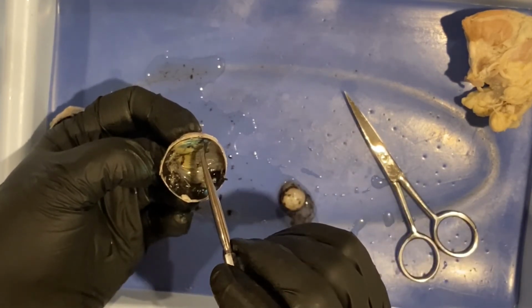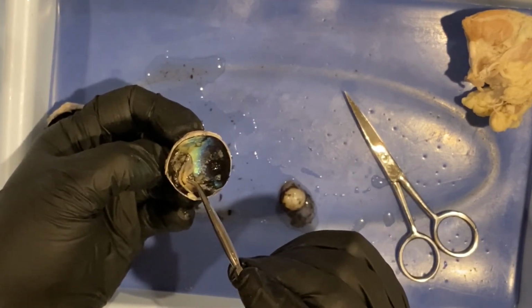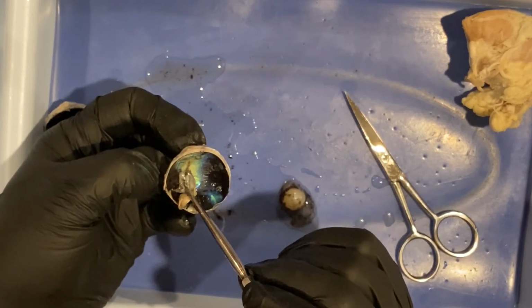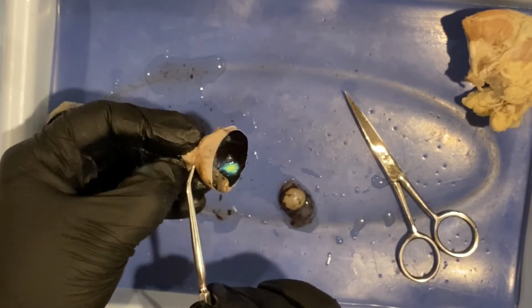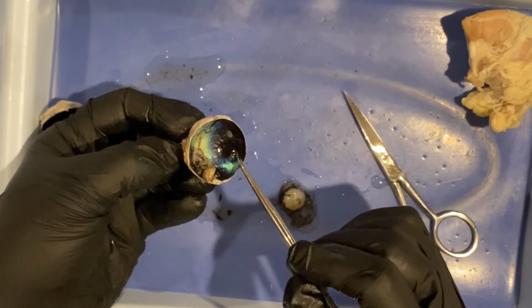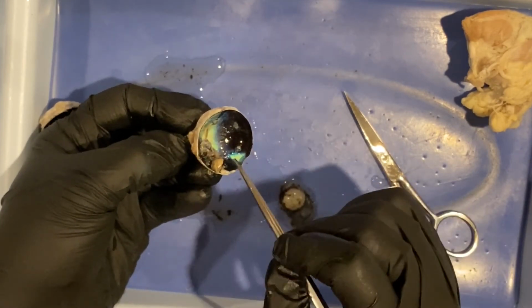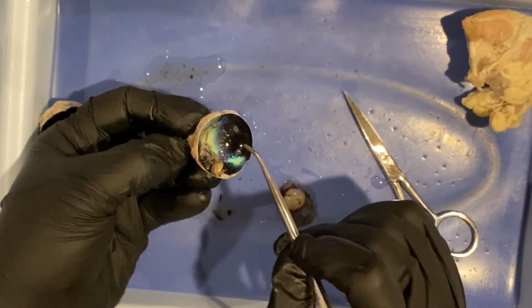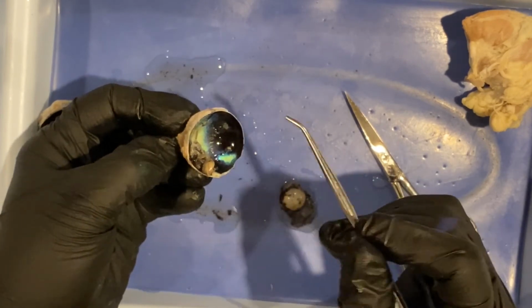Now, if I start to use my probe to pull that retina off, you can see the exposed black material behind it. And actually where the retina is still connected as I'm doing this is telling me that that is where the optic nerve is, and it is right there. So the black portion is the choroid. Again, that is part of the vascular tunic. That's where the blood vessels are traveling. But this dark pigment is helping to absorb any extra light that is coming into the eye.